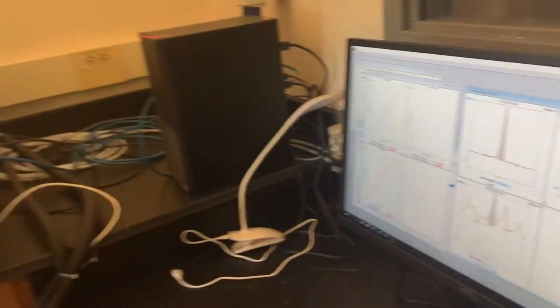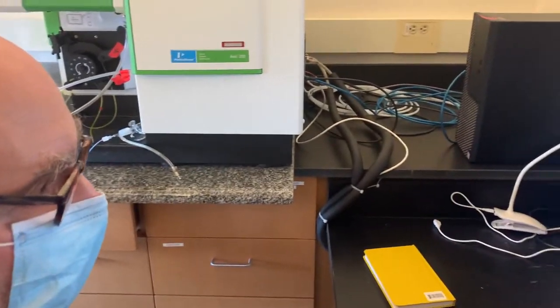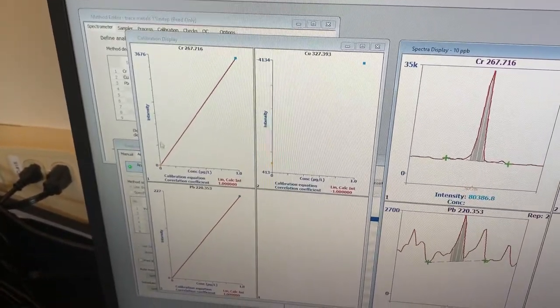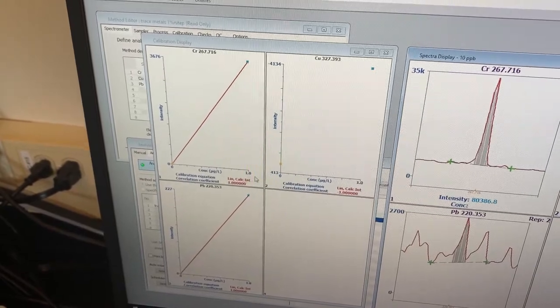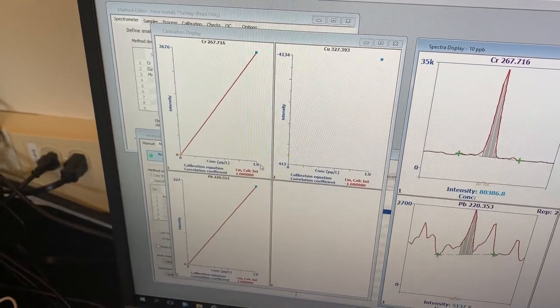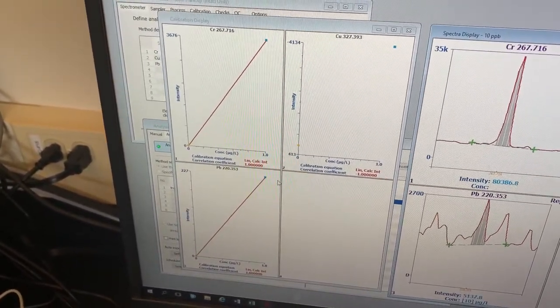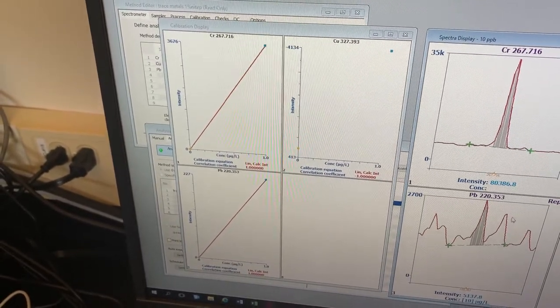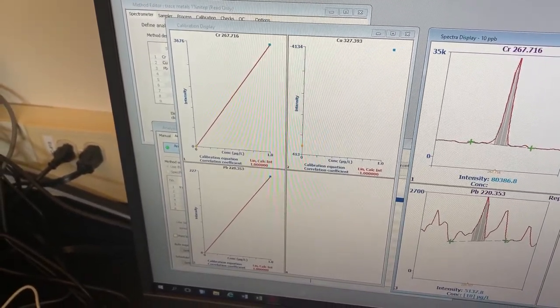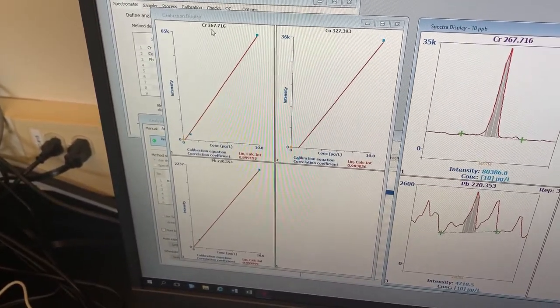We now have our third replicate for copper. And we're waiting on our third replicate for lead. On this side, we have a calibration. And the way the calibration works is we look at the intensity, the number of counts versus the concentration of the element in our standards. And so far, we have just run the zero and the one ppb. And of course, we have a perfect linear calibration because we only have two points to measure. Now, we're going to wait and see. As soon as we get that third lead replicate, this will recalculate and we'll see our calibrations spread out.